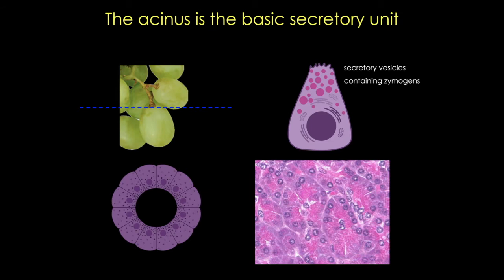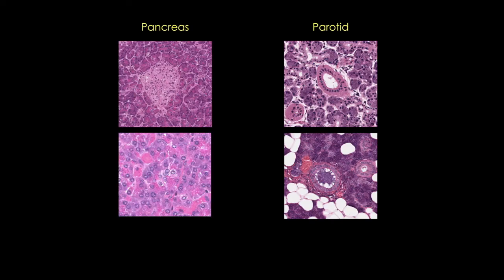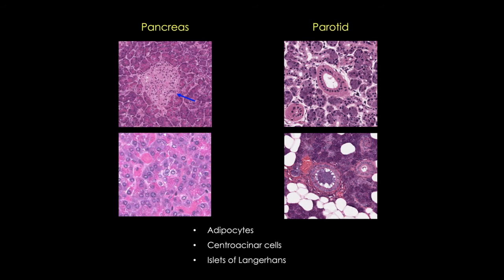So how in the world do we tell these two glands apart? There are four characteristics that can be used to help distinguish the pancreas from the parotid. I'll list them here first in alphabetical order, and then we'll look at each one more closely. First we can look at the amount of stromal fat, since adipocytes are more common in the stroma of the parotid gland. Next, we have central acinar cells, which are the cells that form the initial portion of the intercalated ducts in the pancreas. Third, we have the islets of Langerhans, found only in the pancreas. And finally, we can look for striated ducts, a type of intralobular duct found only in salivary glands.